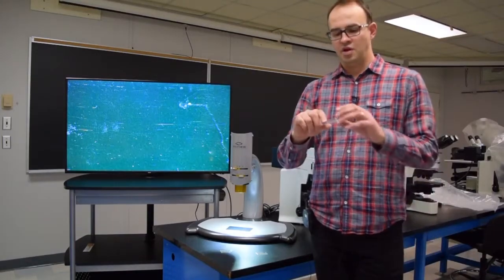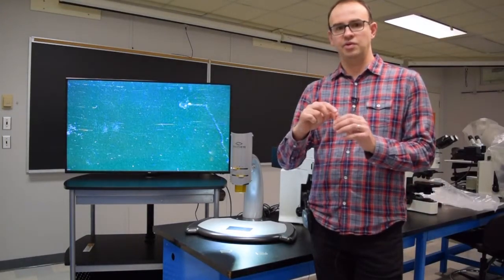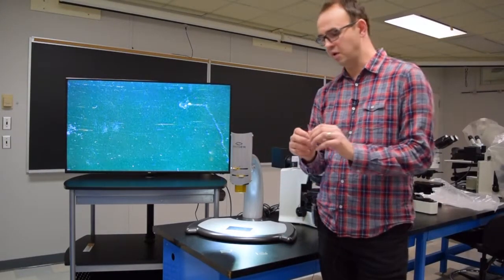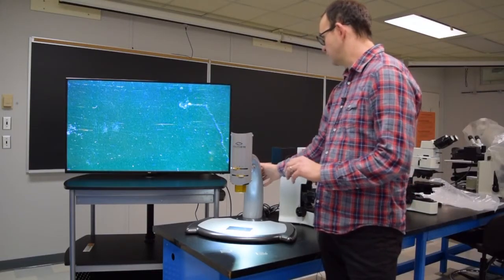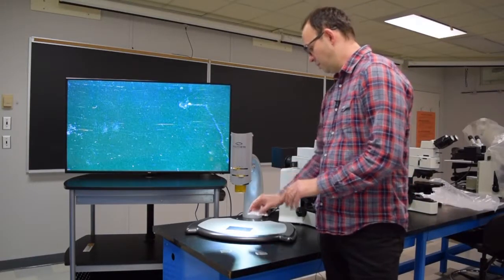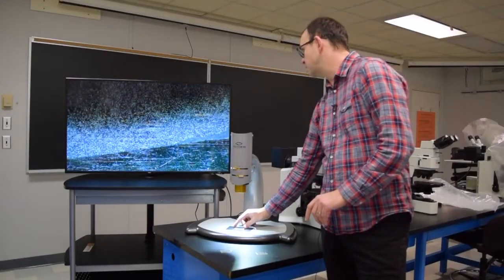They're extremely thin slices of rock, 30 micrometers, that allow some minerals to be transparent. We can look at those transparent minerals on a TV as well.